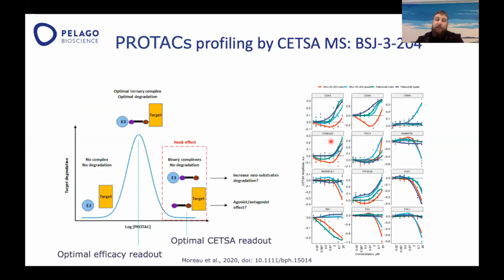What is also interesting here is that the destabilization of RB1 happens exactly the same way with both treating cells with palbociclib and the palbociclib-based PROTAC molecule. All these molecules cause exactly the same destabilization of PLK1 kinase.